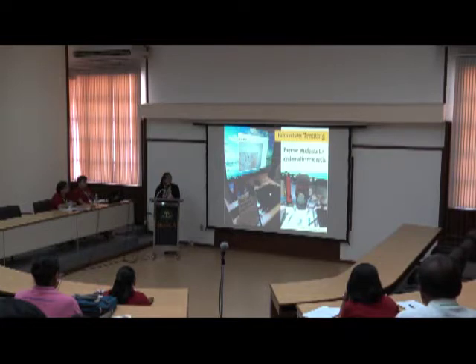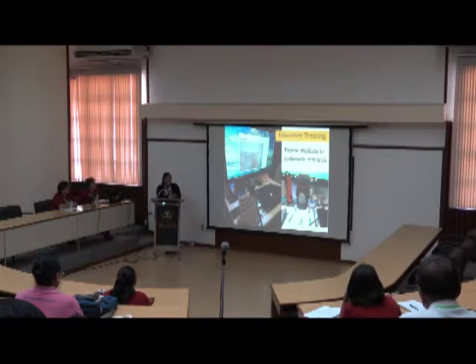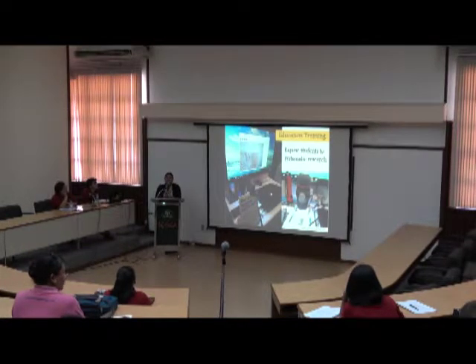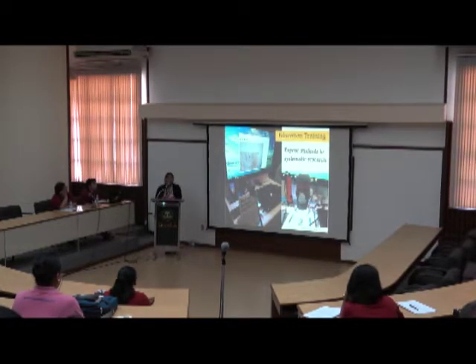So for the education training, we expose students to systematic research. When we say systematic research, there is a procedure on how we conduct wood identification. Here we use this little microscope. This is a xylotron, wherein when we put wood samples here, you can see the anatomical structure of the wood samples. And this one, ito yung mga butas, these are the pores, these are the structures that we observe, so we can properly and accurately identify wood samples in the Philippines and even abroad.